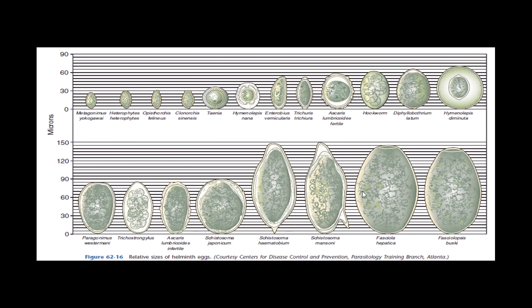Sometimes the shapes of the eggs could be very close, and differentiation from the clinical presentation and the life cycle is extremely important.